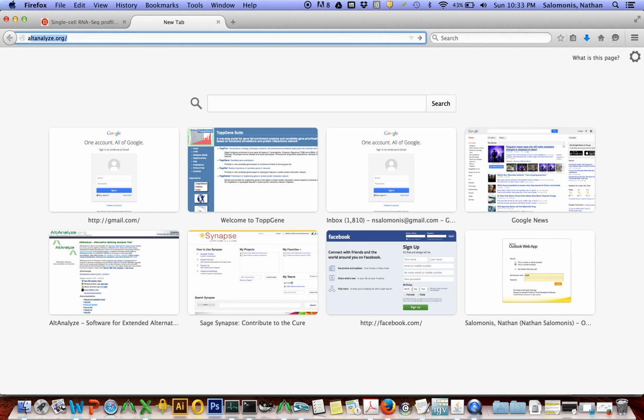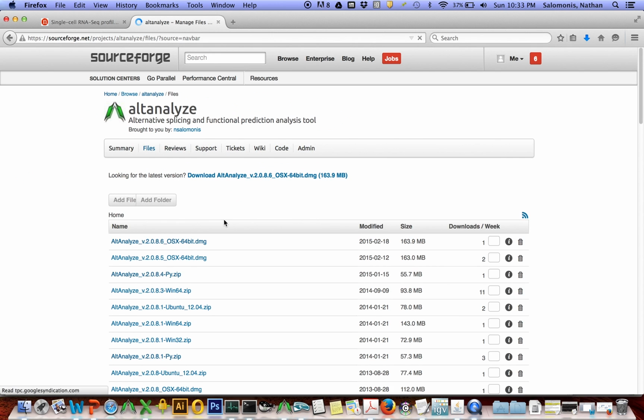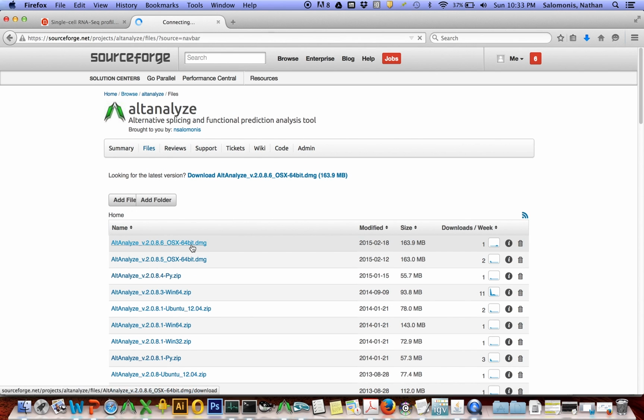To do that, we go to altanalyze.org. There's extensive documentation on this website, including manuals, tutorials, news and updates, a wiki, and an FAQ. There are a ridiculous number of additional pieces of information here you can use. There are standard installers for different versions of the software. There are also development versions. Here I'm going to go to the development version at SourceForge and download it.